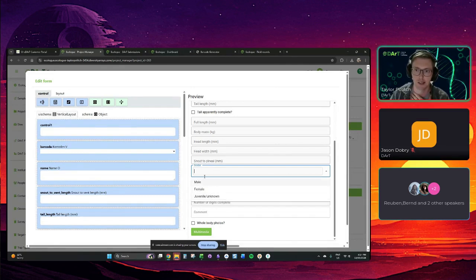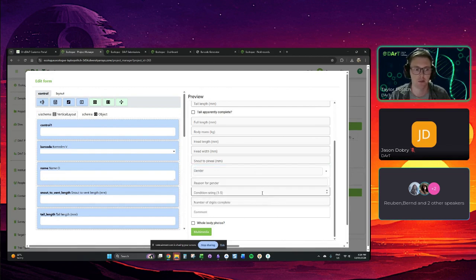But what this does is that if this was a kind of free text string, anyone that's doing it could enter the full word, like male, or they could just type in M. Could be capitalized differently, that kind of thing. So lists are good for getting really consistent data entered. And another thing to mention is that we've got data validation, which is really powerful too.